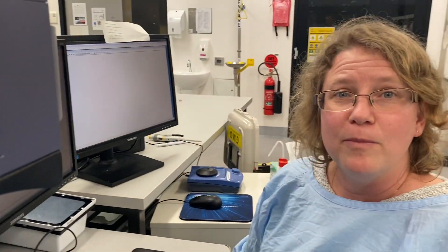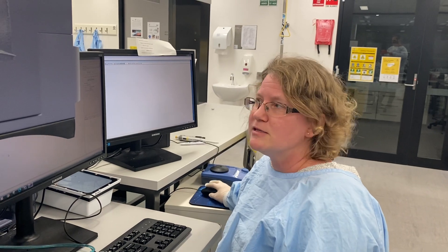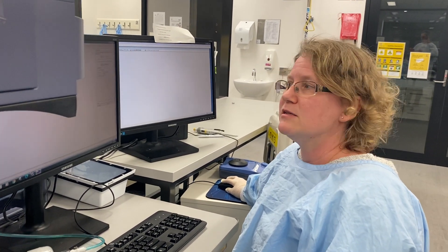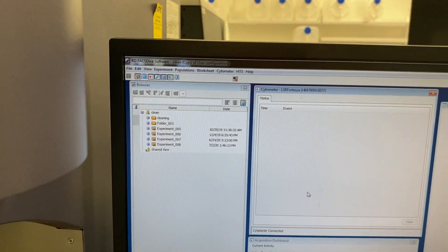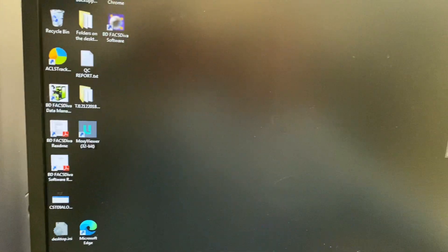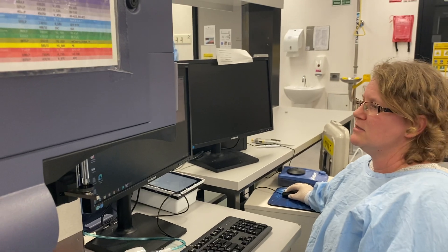If there's a problem, take a picture and send it to me. When it has passed, you click File, Exit and then you come back into Diva — it gets connected again. You log out, minimize, and log out of the ACLS.